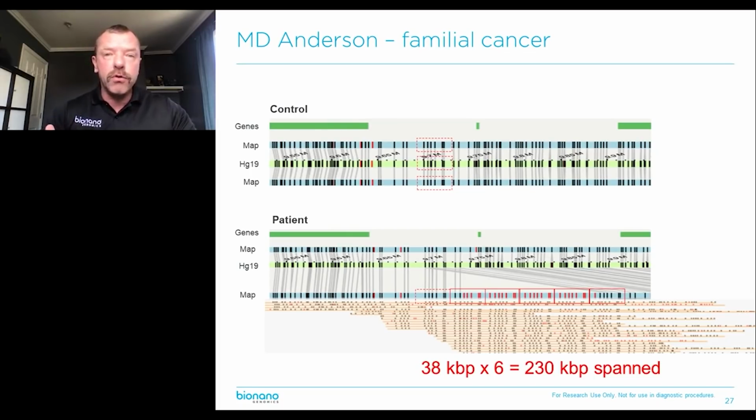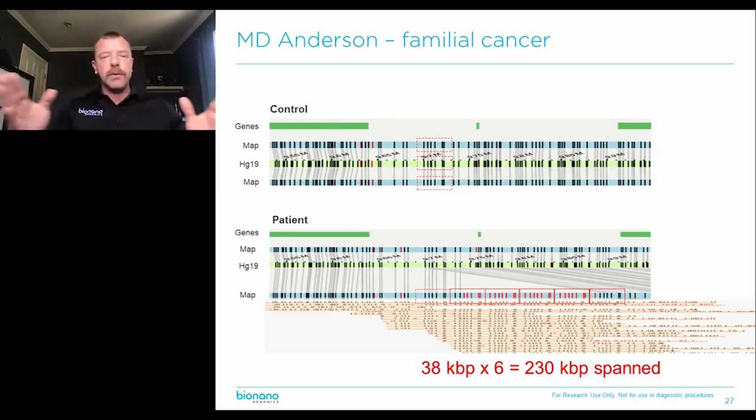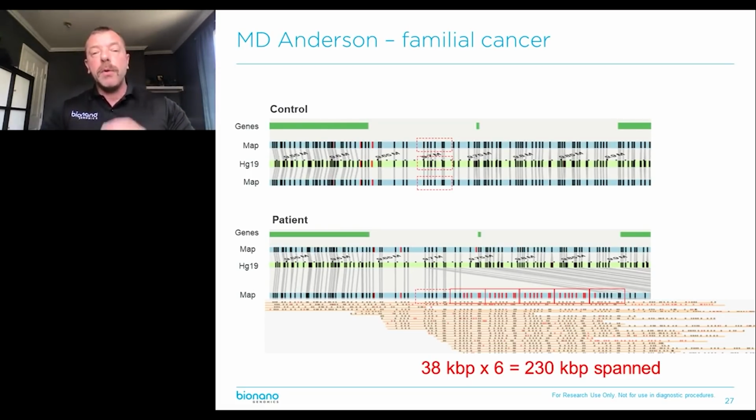Now, how do we know this so sure? We know this because we have single molecules that span the entire 230 kb of that repeat. And that is really the strength of our technology. We observe structural variants directly on single molecules compared to NGS, where they are inferred algorithmically after chopping up the genome in little pieces. And what's important finding here is that that gene unlabeled there on the left is known to be mutated in this tumor pathway. So this is really an interesting finding for this family that was impossible to detect with other methods.